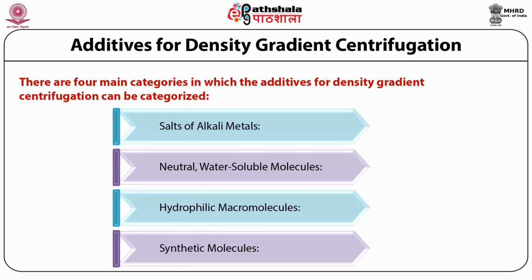Sucrose has very little effect on macromolecules but affects enzyme activity because for an enzyme it acts as a substrate. Due to its high osmotic pressure, sucrose solution dehydrates cells and their organelles very efficiently. Glycerol solutions are the preferred media for the separation of enzymes because they do not affect enzyme activity. They exhibit high viscosity and require prolonged centrifugation time. More importantly, however, glycerol penetrates the biological membrane.